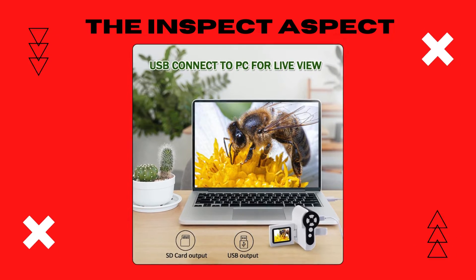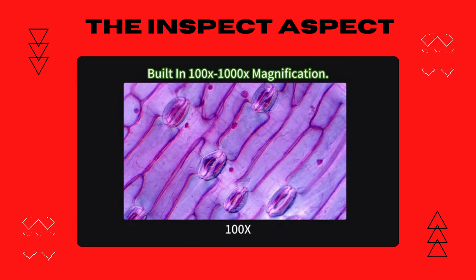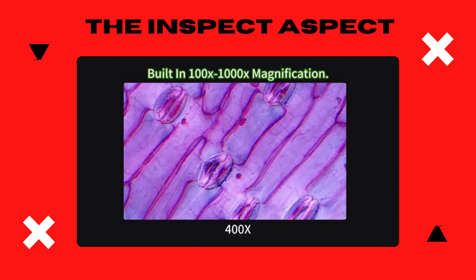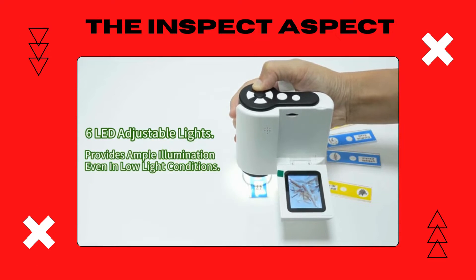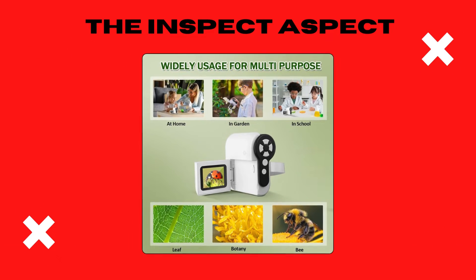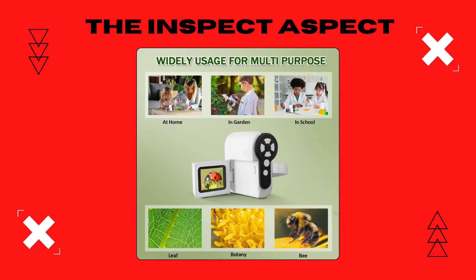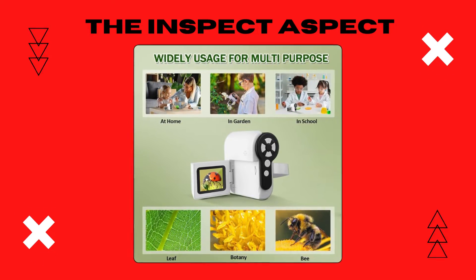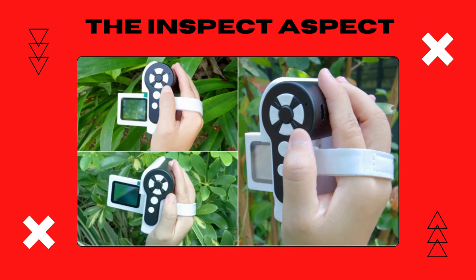It's about merging learning with technology. The microscope is not only portable, but also includes a 32GB SD card for ample storage. The design is robust, yet kid-friendly, ensuring durability for those little hands. It's a tool that transforms the backyard or even the living room into a laboratory of discovery.